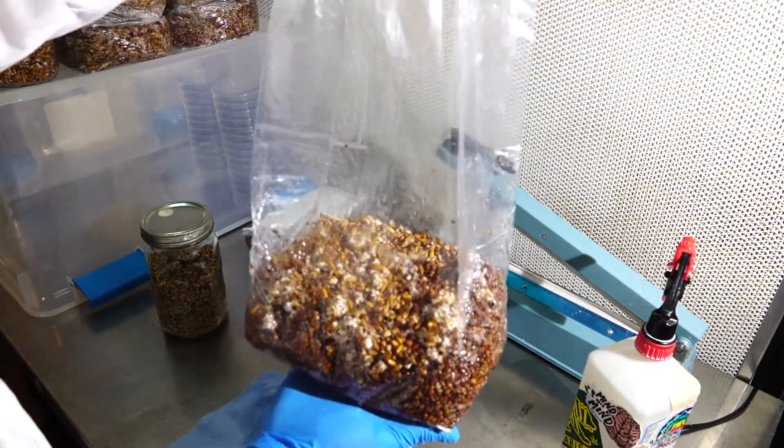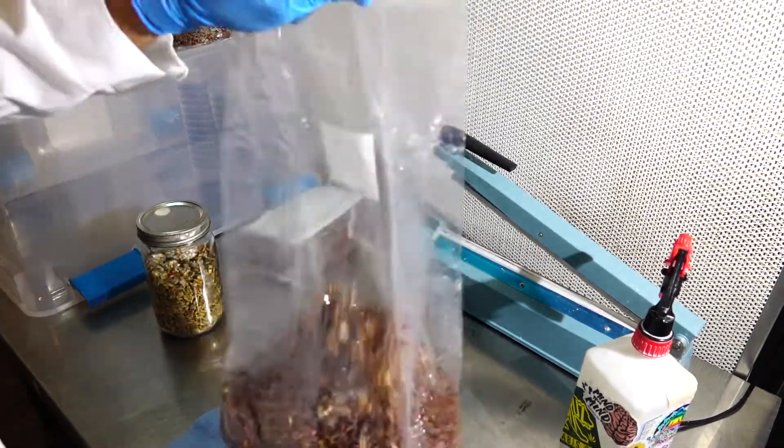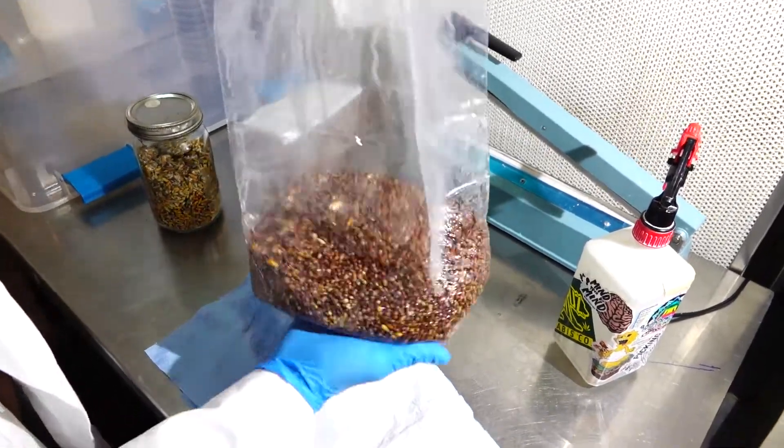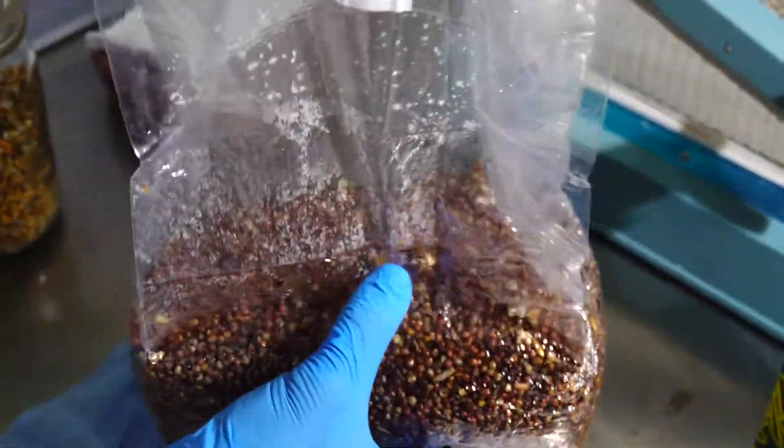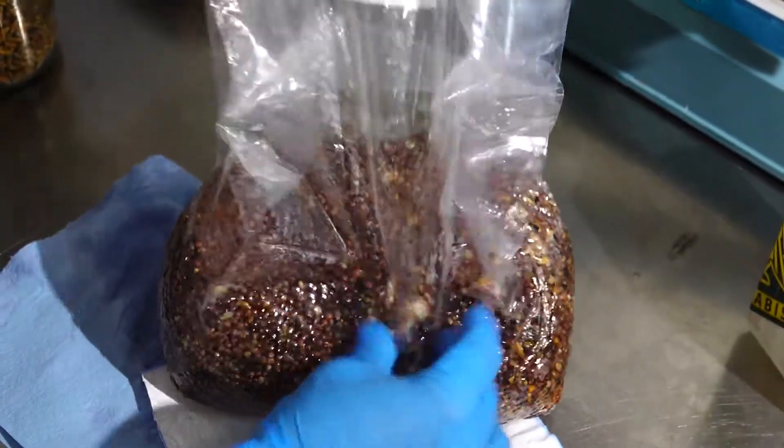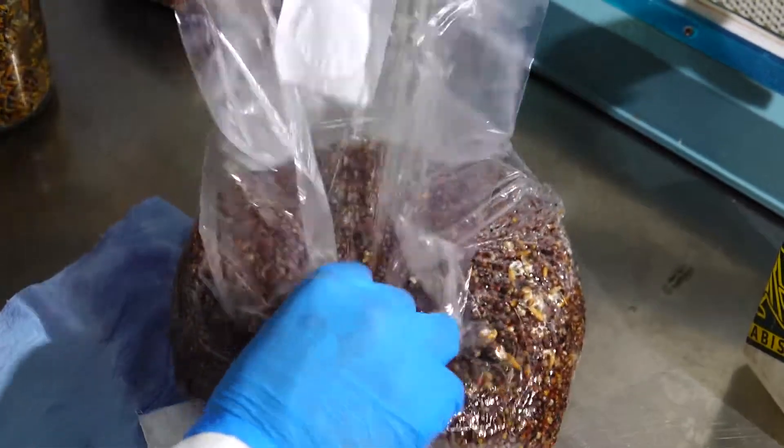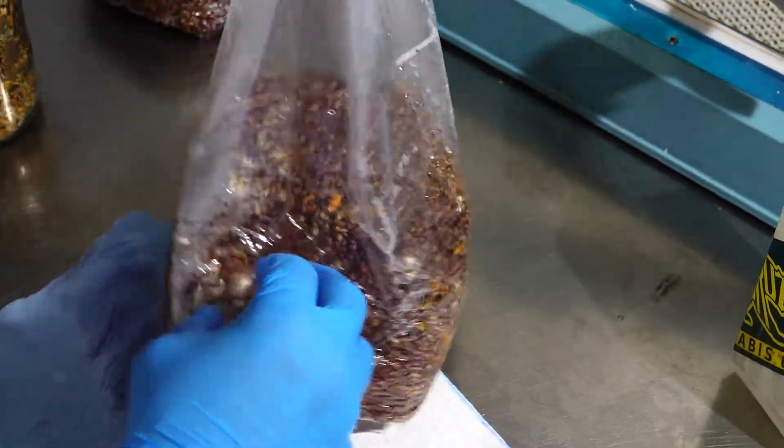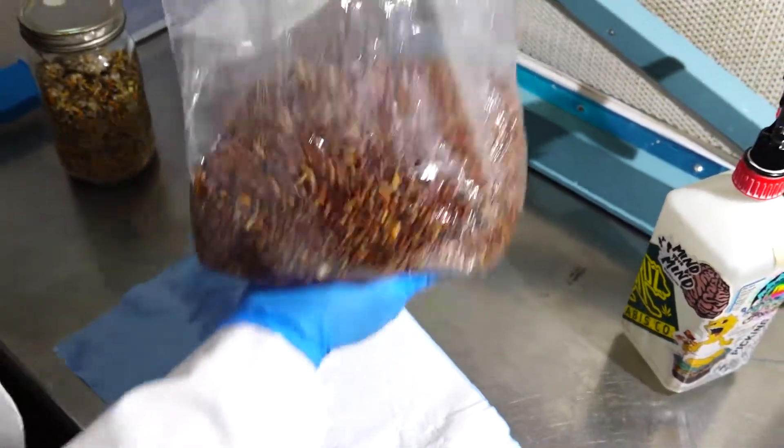The next step is going to be to give your grain a toss so that you can distribute the newly colonized grain into your sterile grain and breaking down any bigger chunks with your fingers and massaging it into the grain. After a couple weeks you'll see some growth and you'll be ready to take it to the next step.